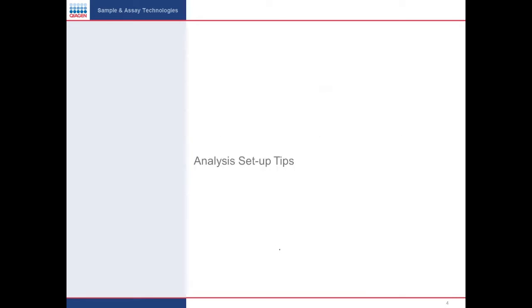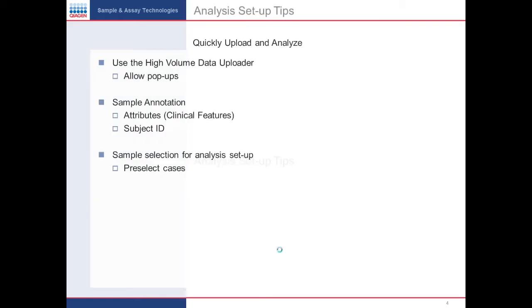So let's begin by marching into the analysis setup tips. There are a few things on my slide here. One is to use the high volume data uploader, and I'll go through each one of these. I'll just show you briefly.